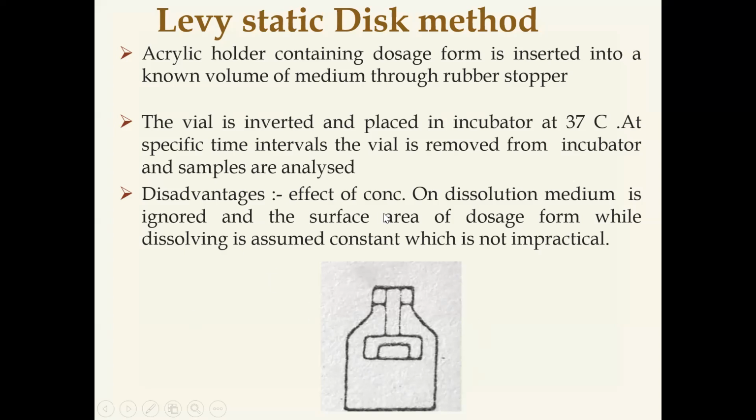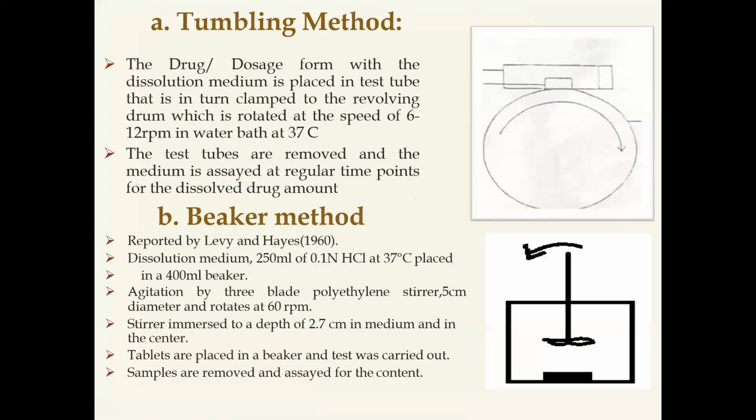The disadvantage is that the effect of concentration on dissolution medium is ignored, and the surface area of the dosage form while dissolving is assumed constant, which is not practical. This is about Levy static disk method.